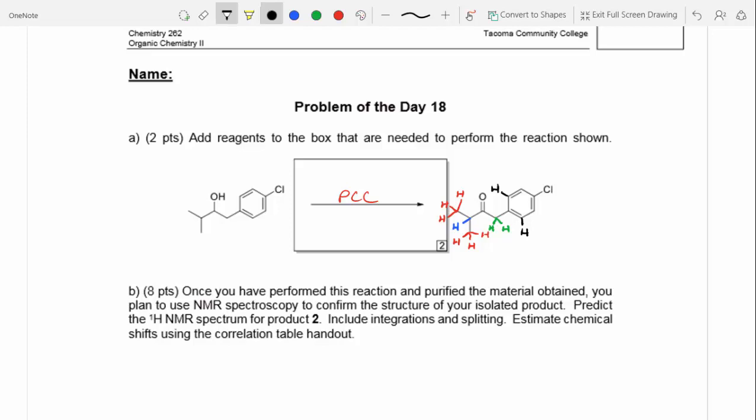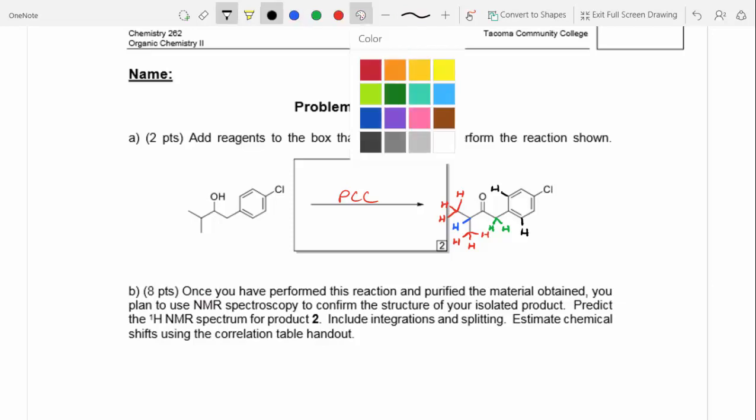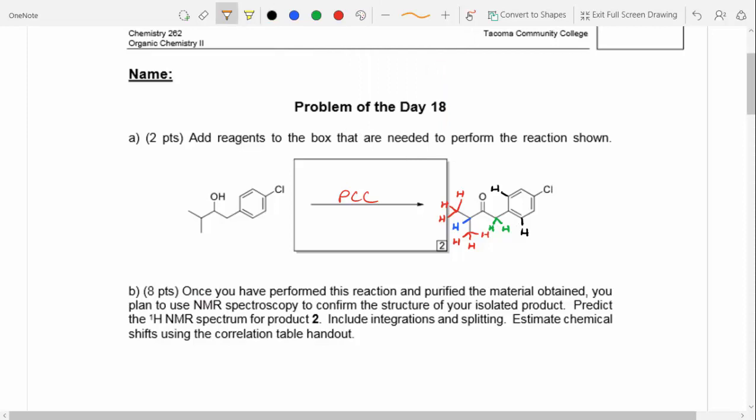The same. A few people were asking me, they were saying, well, this one up here, it's closer to the oxygen, so why isn't it in its own chemical environment? It can spin, right? So that ketone that's coming off of the benzene ring will spin around, and it has equal probability of being on either side. So in this case, they both share that same chemical environment. So we'll label that as H, and then let me come up with a different color. And we've got these protons over here.